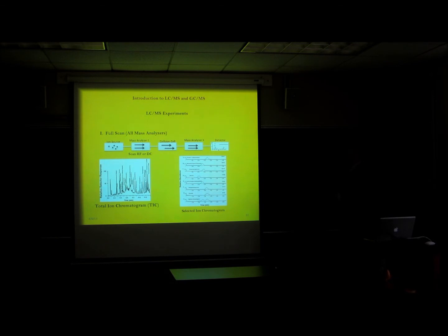Finally, I just want to talk about some of the different mass spec experiments you can do when combining with liquid chromatography. There's a lot of different ways you can set up the mass spec detector to get different types of information from your separation and detection of whatever system it is you're studying. The first and most straightforward, and what I'm going to do is use a triple quadrupole mass spec as a model for talking about these things.